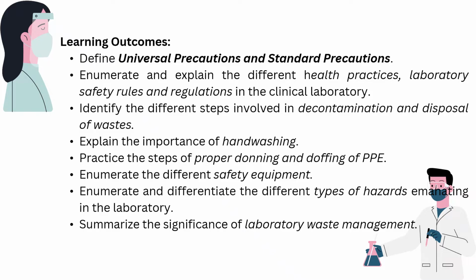We'll also be able to identify the different steps involved in the decontamination and disposal of wastes, and explain the importance of hand washing. I think you have already mastered hand washing because you've been doing this since PMLS up until this time. So by this time, you can explain its importance.